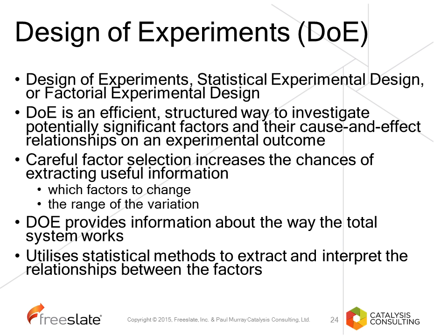We have something that we think is important, like temperature or concentration or the amount of base or the type of base, and we change those. We change those for a reason, and that is because we believe they will affect the outcome of the experiment. And by studying it with the experimental design, we can understand what that effect is on the outcome of the reaction, be that yield, be that selectivity, or some other factor.